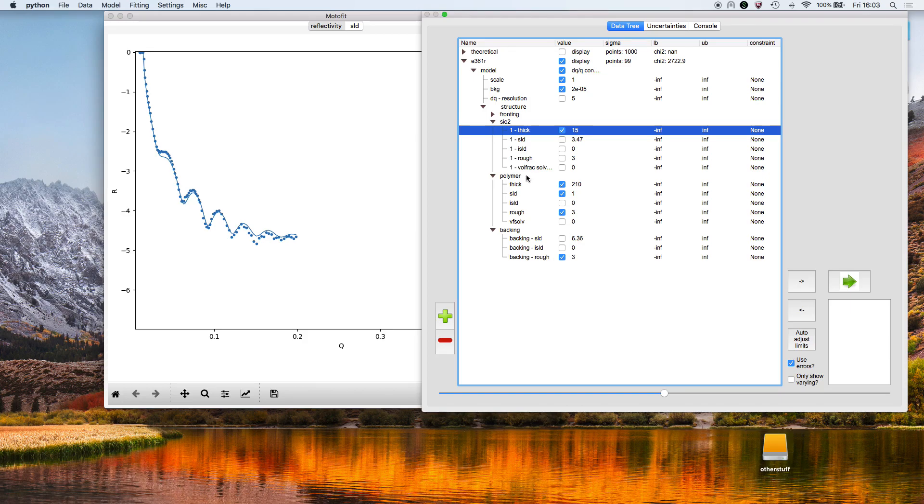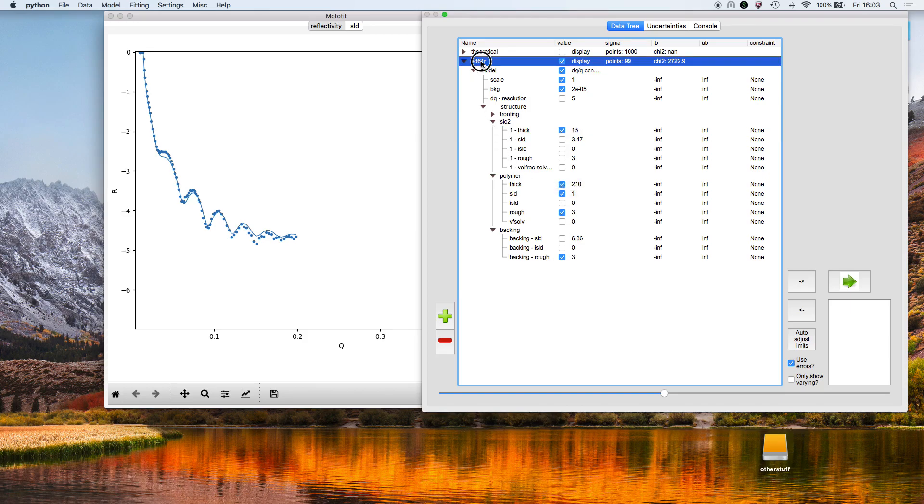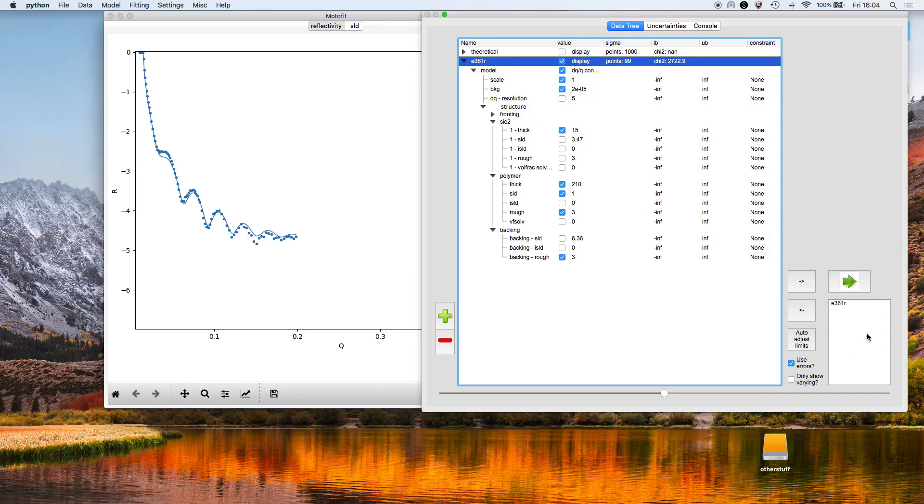I'm going to drag this dataset across over here. Over here is listed all the datasets that are going to be fitted when we press go.